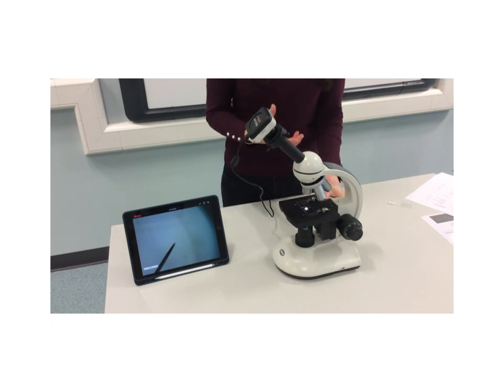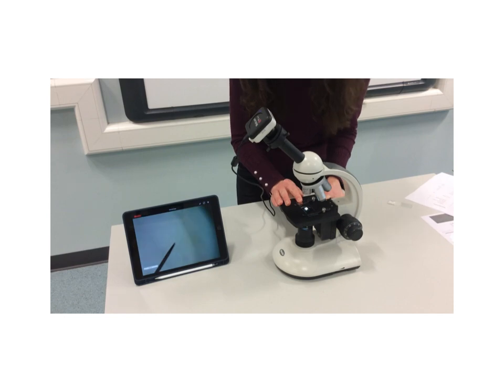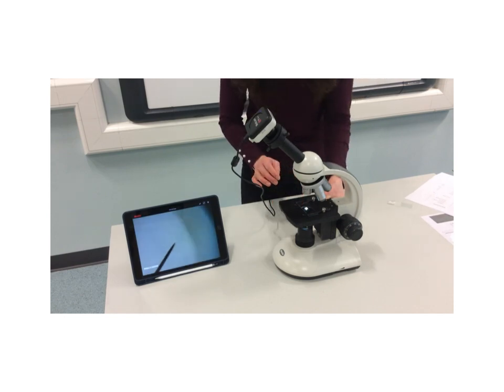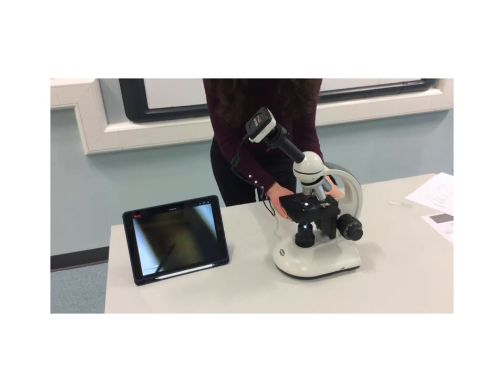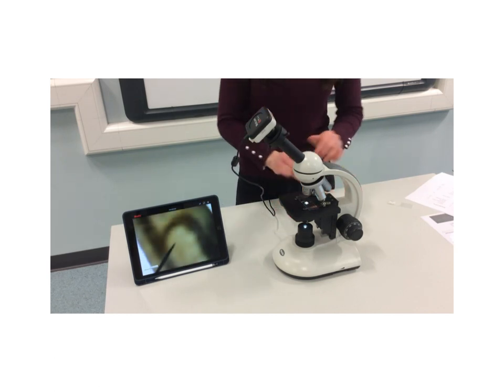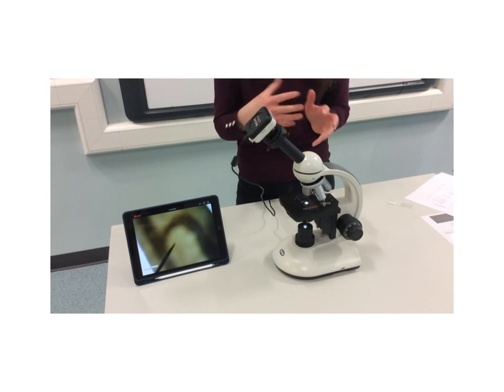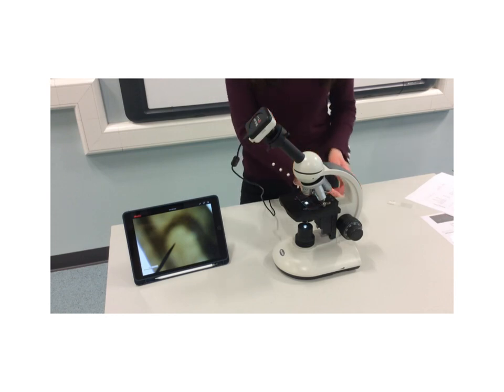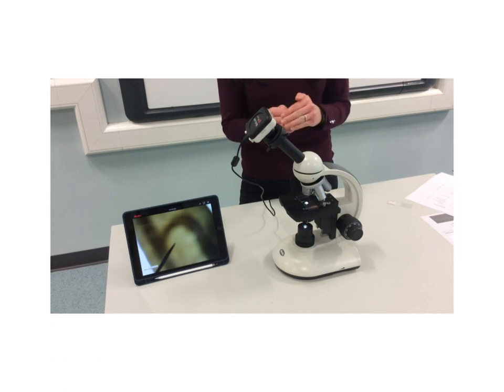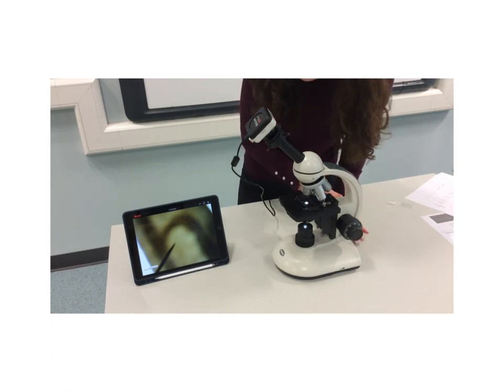So as I said, when we're viewing an image, we always start with the low power lens first of all, and we were able to see something a minute ago, but we can't quite see it now. So what we normally do is bring it up as high as we can, because it's really important when we're focusing this that we don't allow the slide to touch the objective lens, because that can cause it to crack. So it's better that we make it as close as we can without them touching, and then focus away. So let's see if we can get an image. We can nearly see something there.